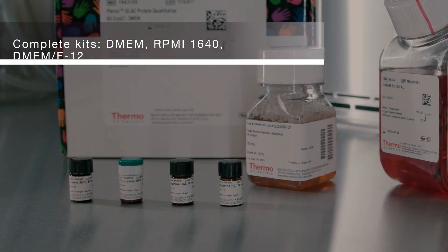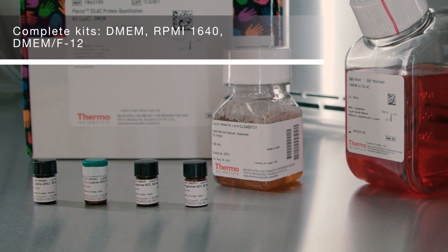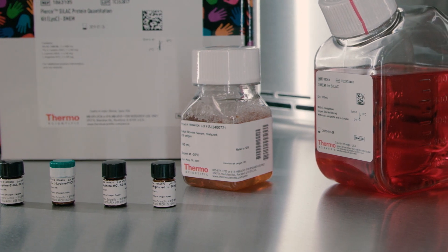To simplify your SILAC experiments, we offer complete kits for Lys-C or trypsin digestion. Each kit contains SILAC media, dialyzed FBS, light and heavy amino acids.